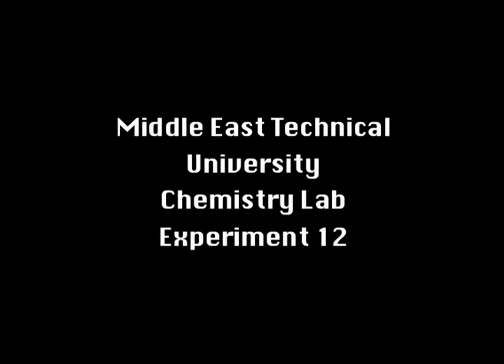Experiment 12: Electrochemistry Voltaic cells. Chemicals and apparatus.